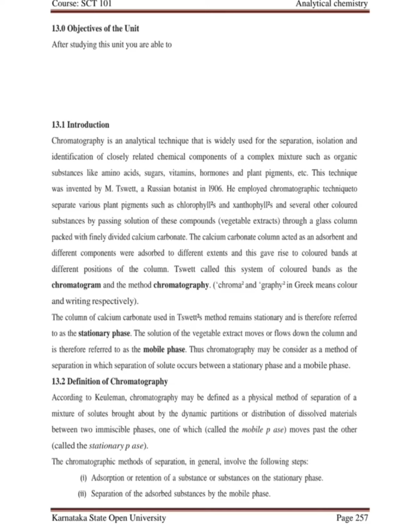So what is chromatography? Chromatography is an analytical technique. It is widely used for separation, isolation, and identification of chemical components of a complex mixture. It is mainly used for the separation of mixtures. If only one component is there, you don't need to use a chromatographic technique to separate.